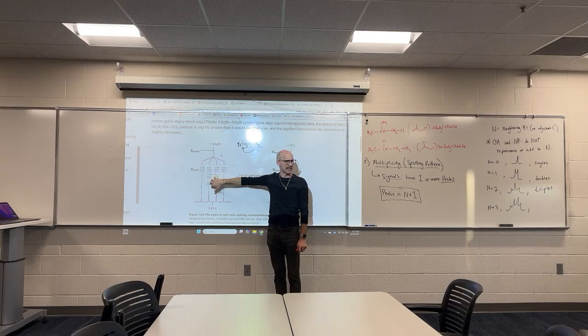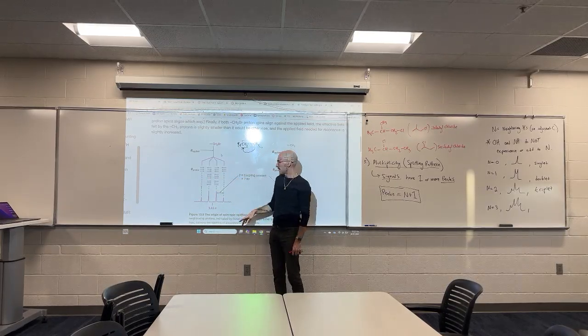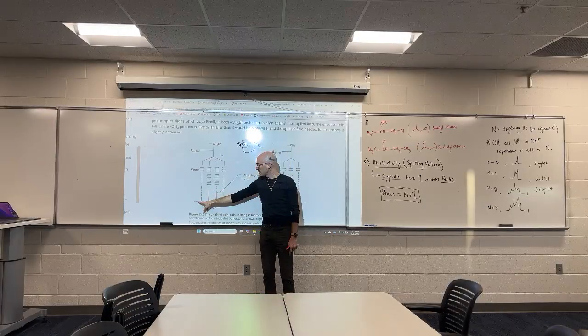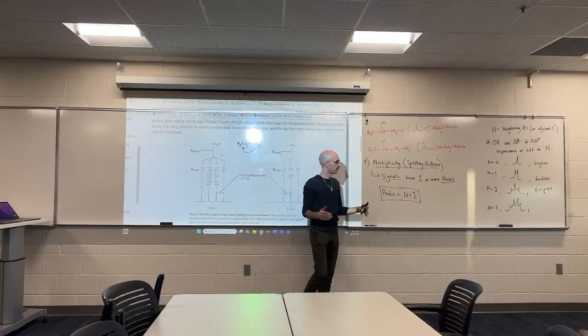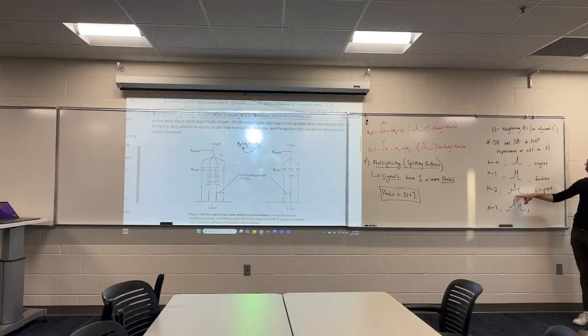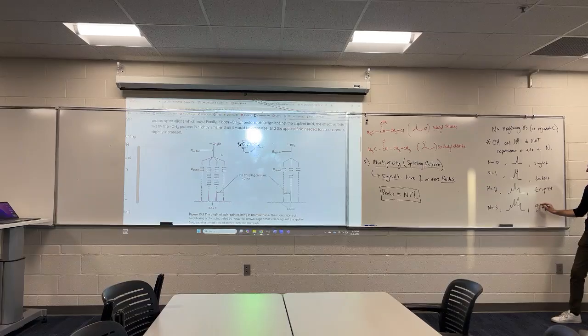Those alignments make different impacts on the signal. And so you get these equal chances in the middle, twin peaks, and these equal chances on the outside that are less often, twin peaks. So you get this shape, small, tall, tall, small. And we call this a quartet.